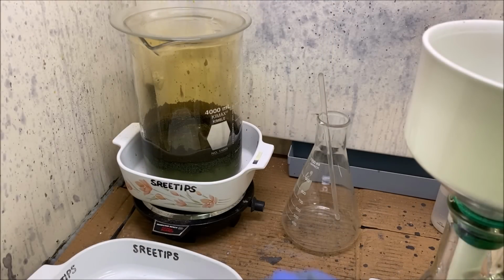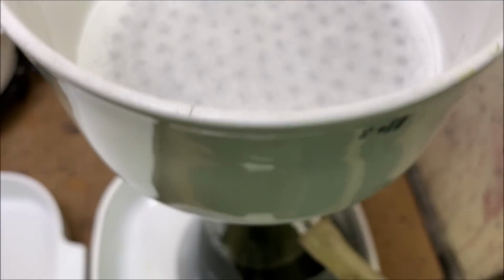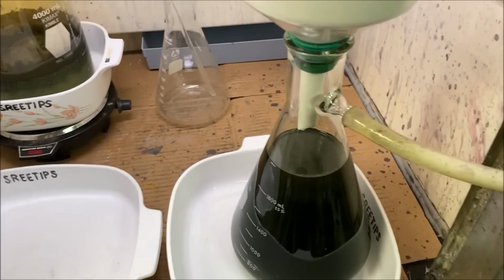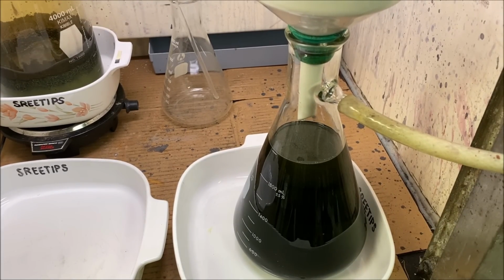This second extraction has been on boiling now for about 2 hours, and we've got all the solution pulled through this filter. So now let's go ahead and try to get our solution, our gold bearing solution, into a beaker for precipitation.